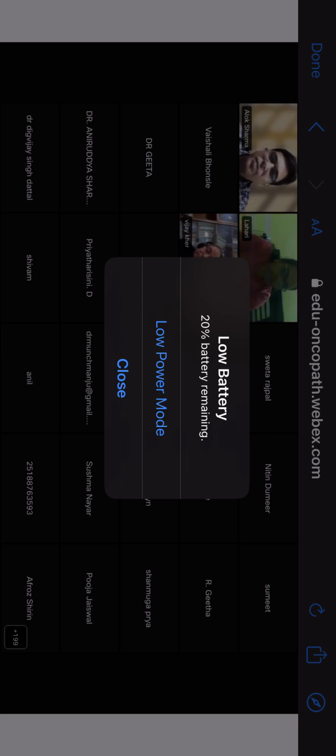Dr. Silkira asked, what should be the thickness of biopsy section to look for amyloid deposits? Okay, so that's a good question. Normally we rarely miss amyloids even in 3 micron sections. So there is a conception that you need thicker sections. It will be good if you have thicker sections, but even if you do Congo red staining on your routine sections, you will never miss amyloid. You will never have to cut more 8 micron sections just to detect amyloid.